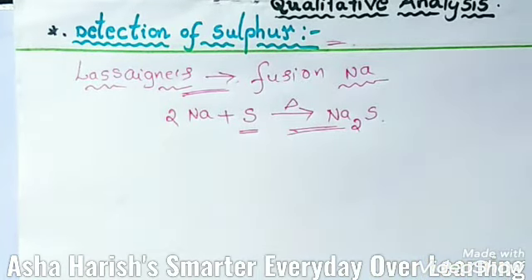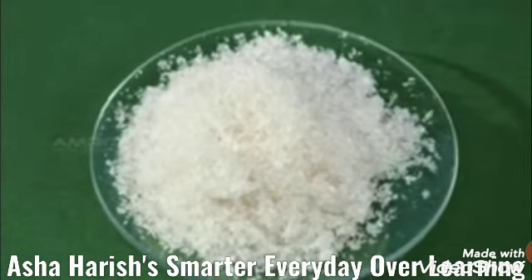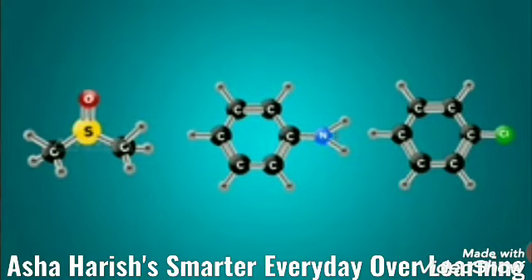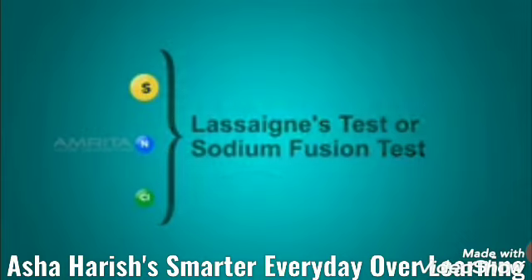Let's see the preparation. Okay students, just by using this Lassaigne extraction, we have to do the experiments to detect some elements. Now let's see the preparation of Lassaigne extract. This is the organic compound we have to take for the detection. The most reliable test for detecting these elements in the organic compound is this test, in which the elements present in the organic compound are converted from covalent form into ionic form.